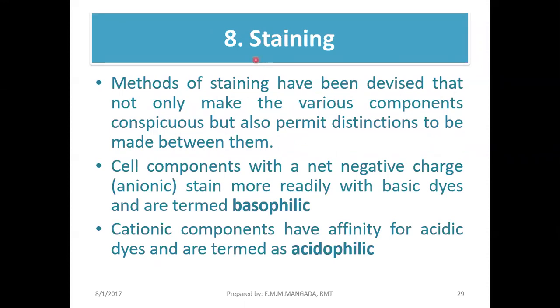Guys, in the routine histo techniques, the stain that we usually use is actually your hematoxylin and eosin. Okay, this is, again, the routine stain for histology. Not only for histology, even for histopathology, okay?